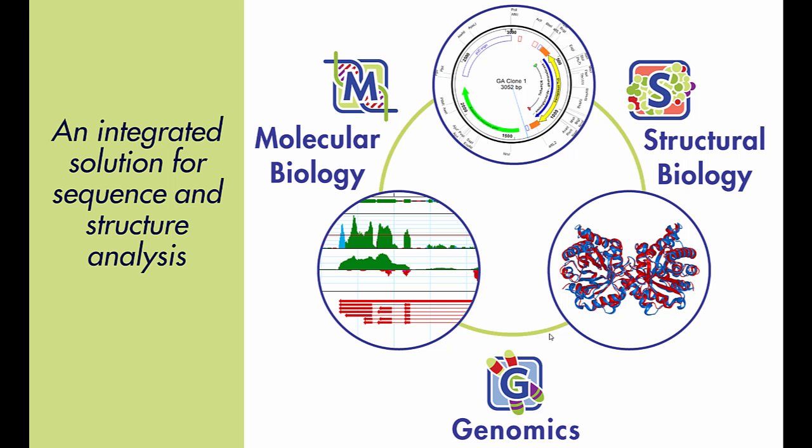And since we're talking about the DNASTAR Cloud today, it's worth mentioning that in addition to our cloud assemblies, which we'll be looking at shortly, our structural biology tools also integrate with the DNASTAR Cloud, allowing you to take advantage of cloud computing resources to predict protein structures. If you're interested in that, please check out our NovaFold webinars. Those are available on our website. We also have some shorter videos on that topic as well.